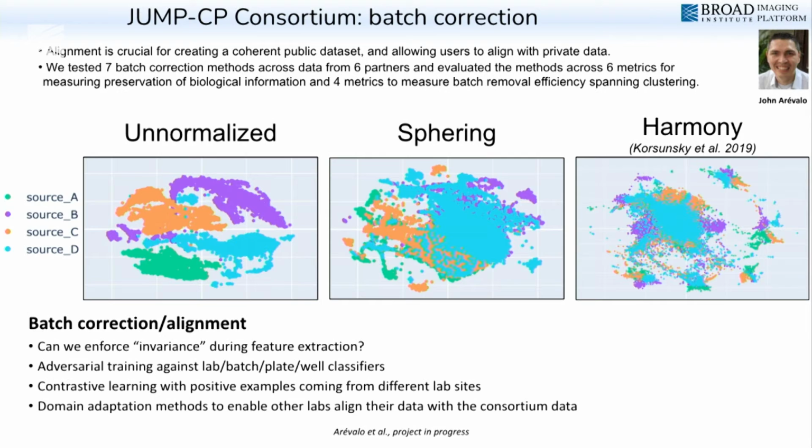One such ongoing effort in our lab is to develop batch effect correction methods, for the most part by repurposing successful techniques from the single-cell RNA-seq community, where there's been a lot of activity in this front over the last few years, if you've been following that literature. Batch effects, especially in high-dimensional biological readouts, as many of you might know, can really blur out the signal, and they're really the bane of our existence in some sense.